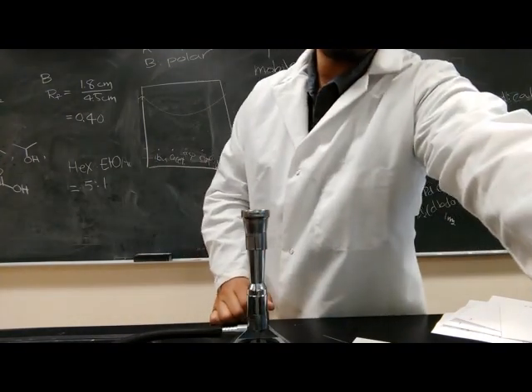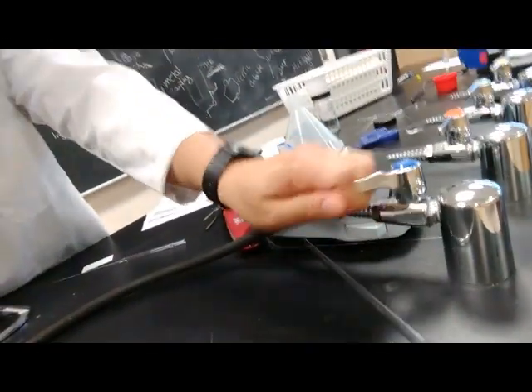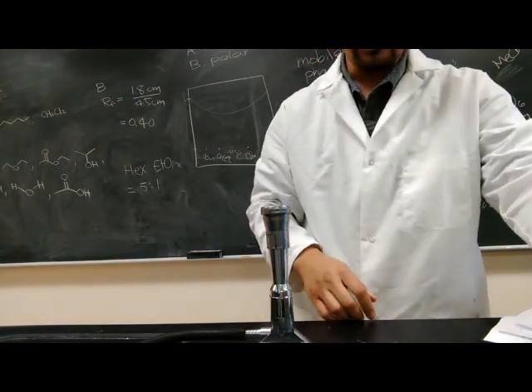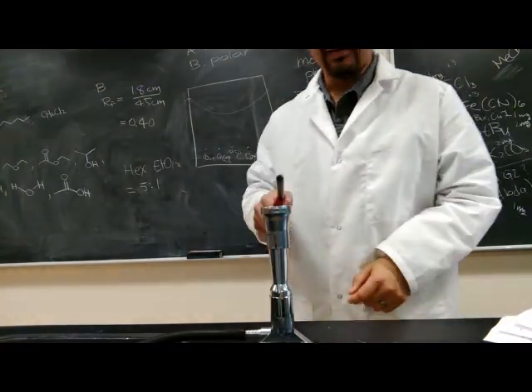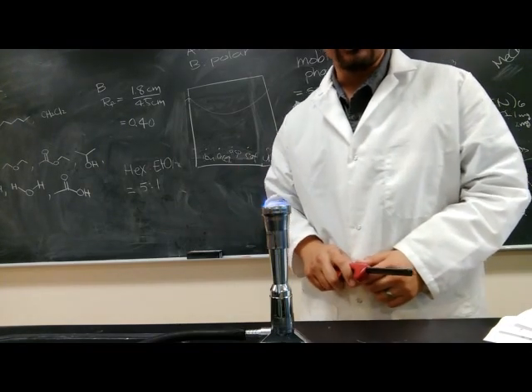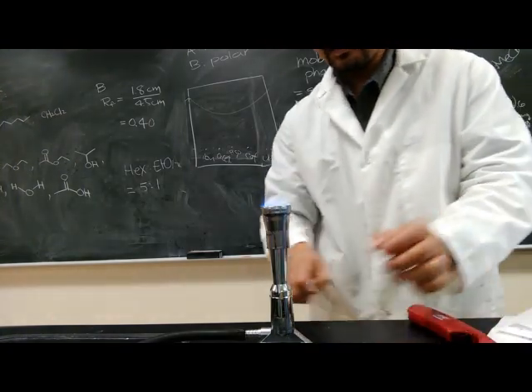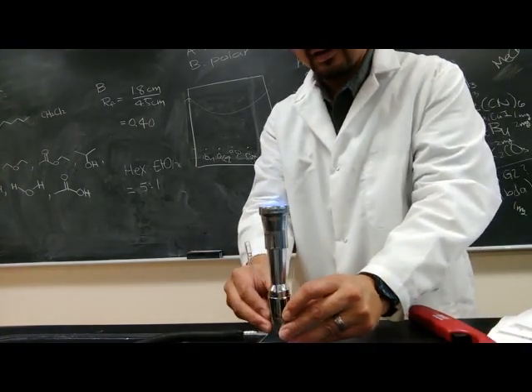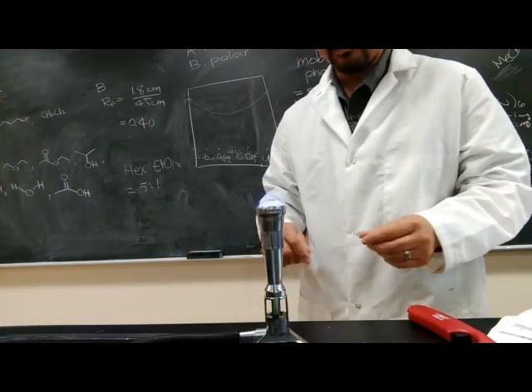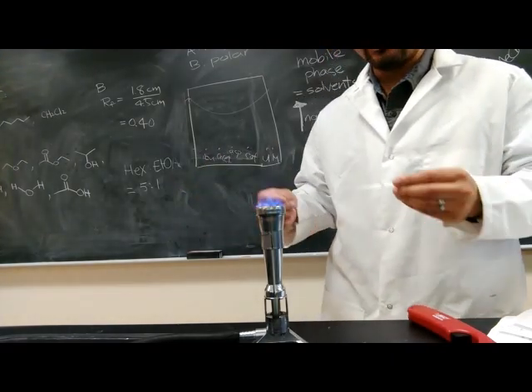So what you will do is first turn on the main gas, right here, and you might be able to hear the hissing sound, but now gas is coming out of the Bunsen burner. And I've just lit it. I don't know if you can see that, the blue flame. Now that it's lit, you can open the air gate fully so that it's getting enough oxygen to combust at a really high temperature.